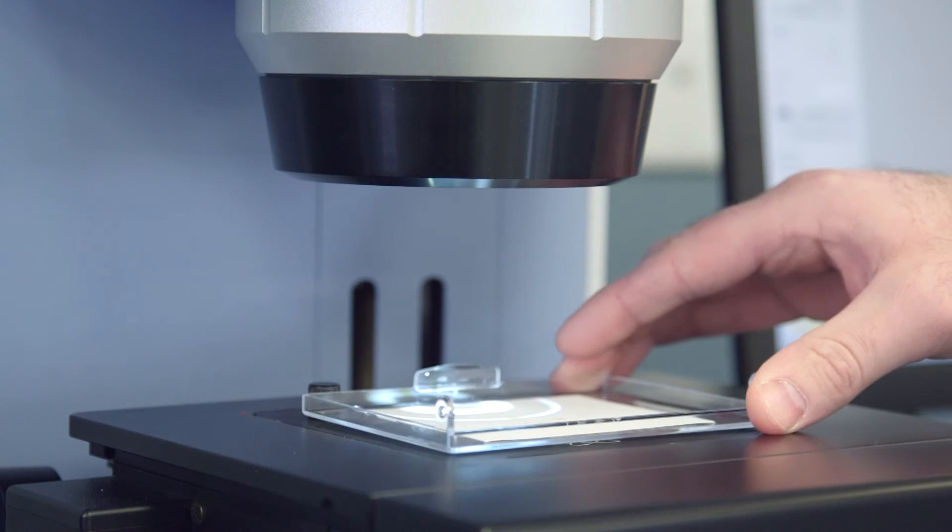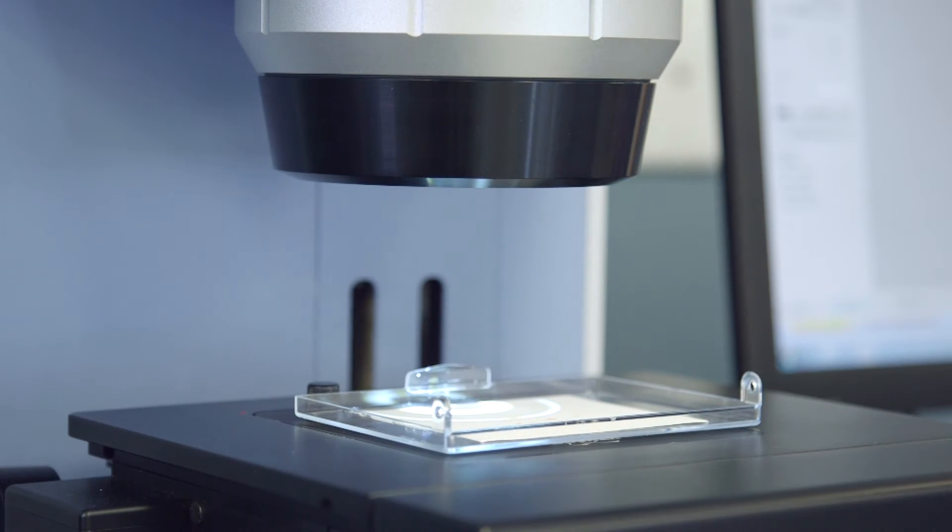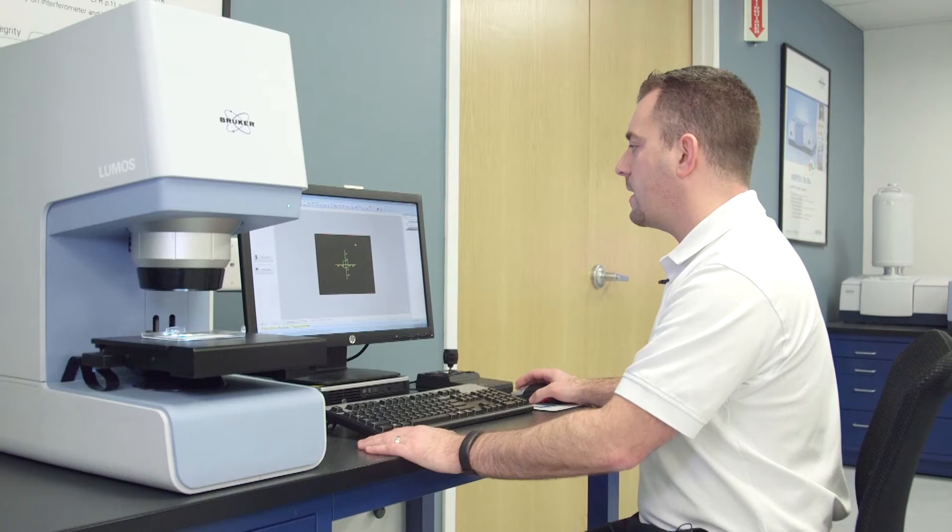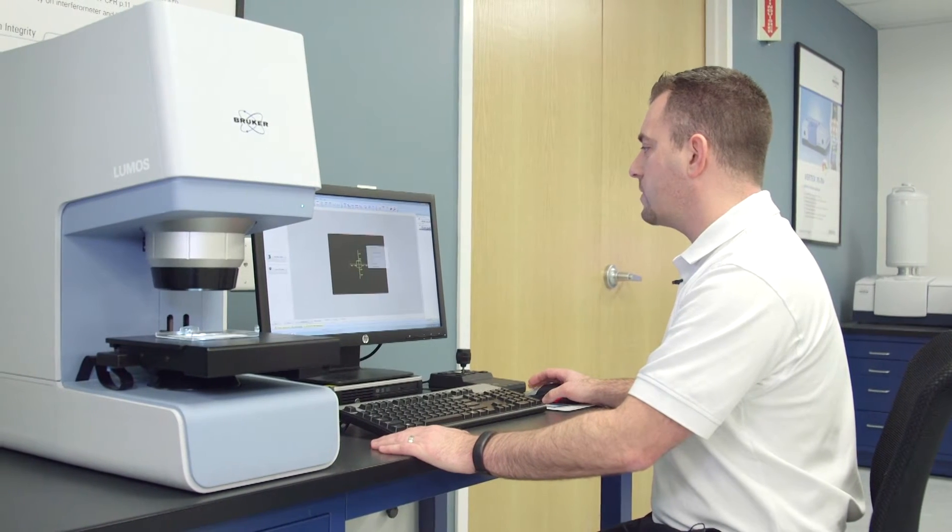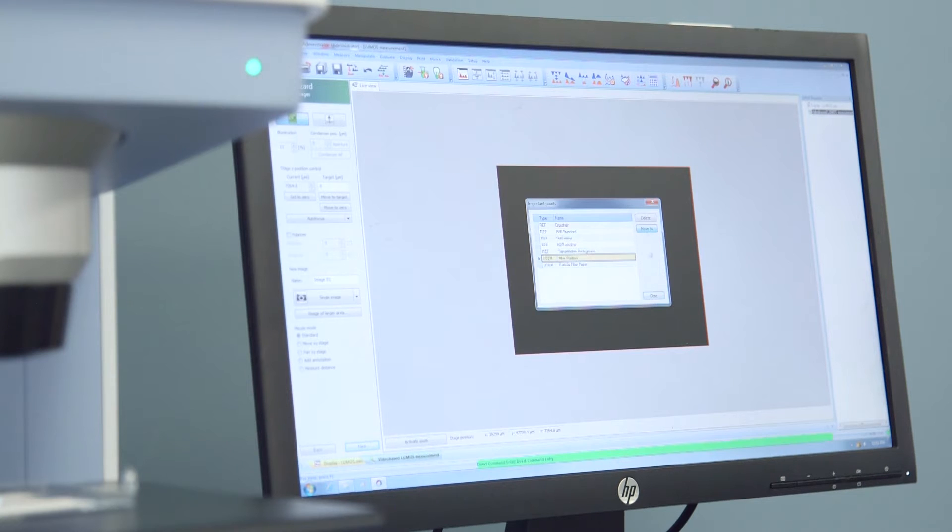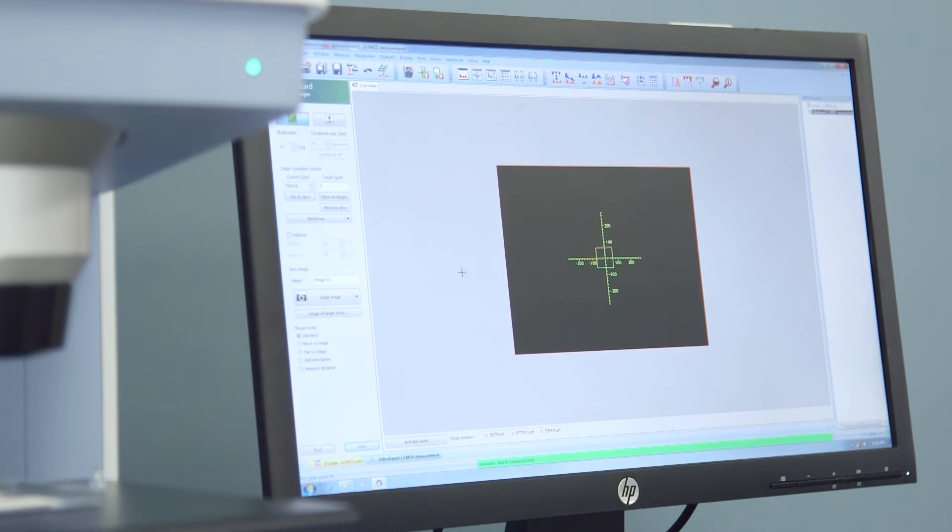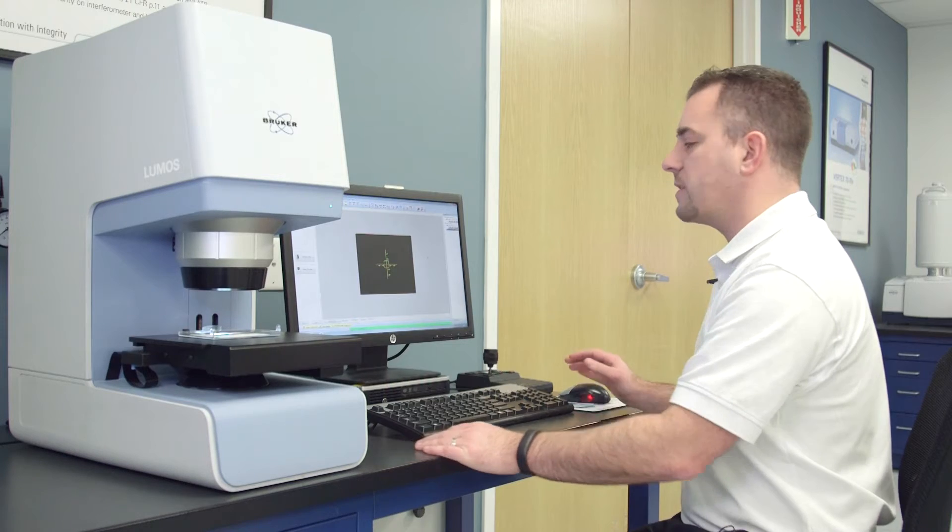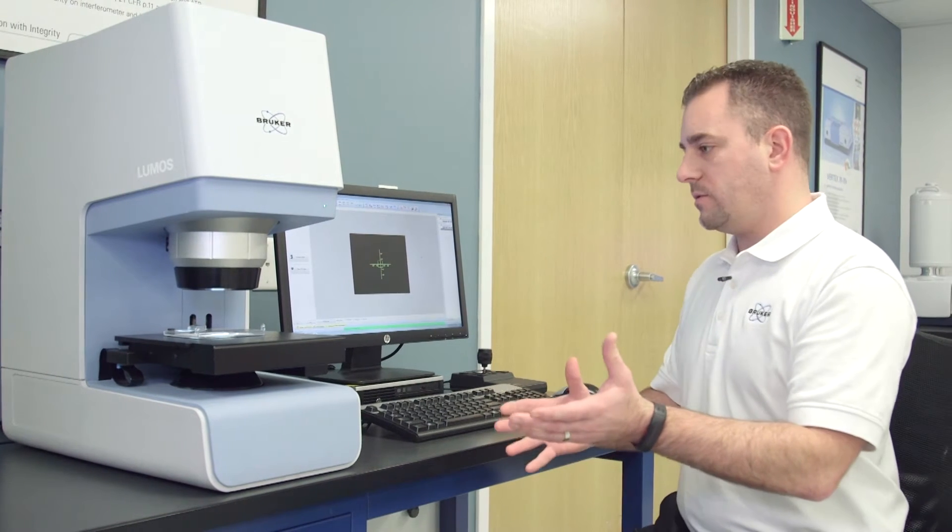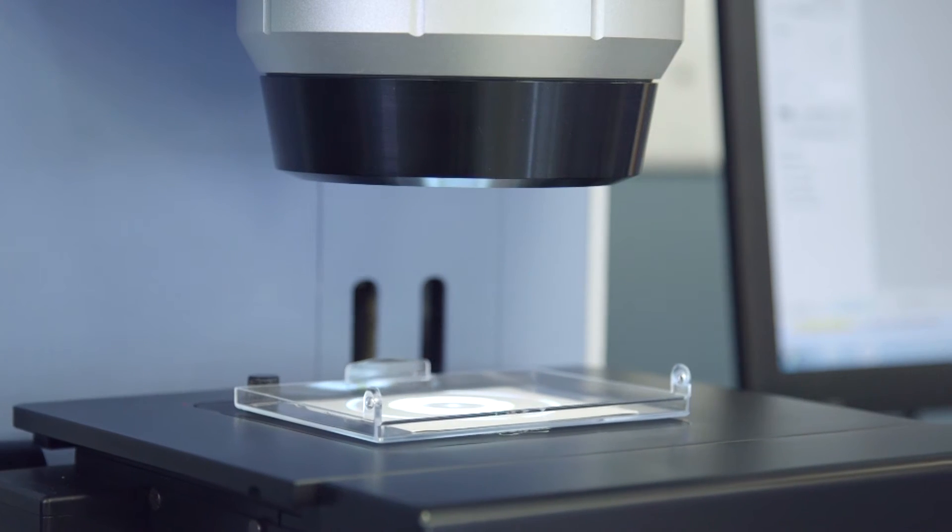So first I'm going to put it right around the stage, I'm going to come over to the software, and in the software I have some pre-loaded points. In particular I can go to my filter paper position and what this does is it brings the stage to the best point of focus for my filter paper.